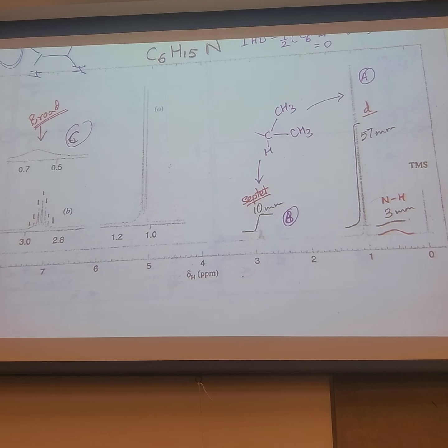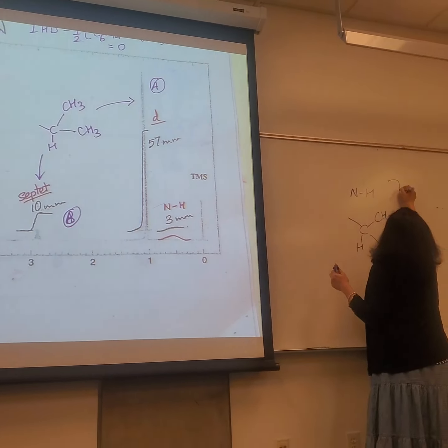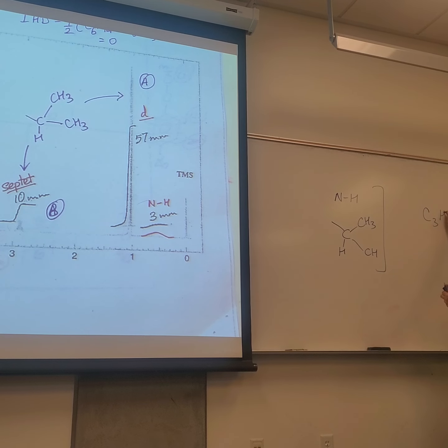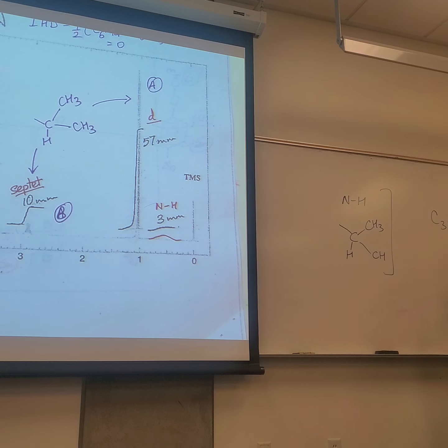Do you all agree that so far we have seemingly an NH bond, right? Yeah. As we see that. We have an isopropyl group. How many carbons taken care of in these 2 pieces? 3. How many hydrogens taken care of in these pieces? CH3, H. 7, 8 total, are you sure? Oh, sorry, I forgot the CH3 there. 8. 8, right? And how many nitrogens? 1.